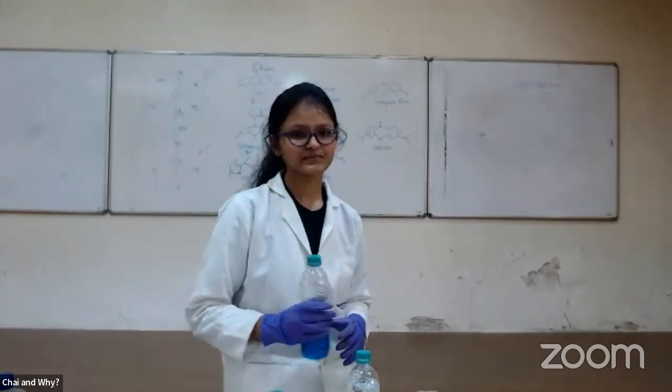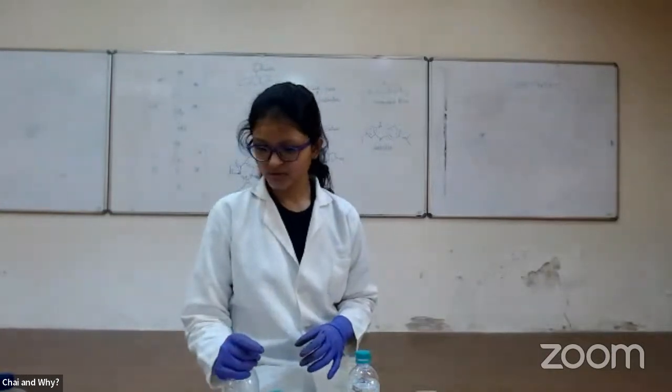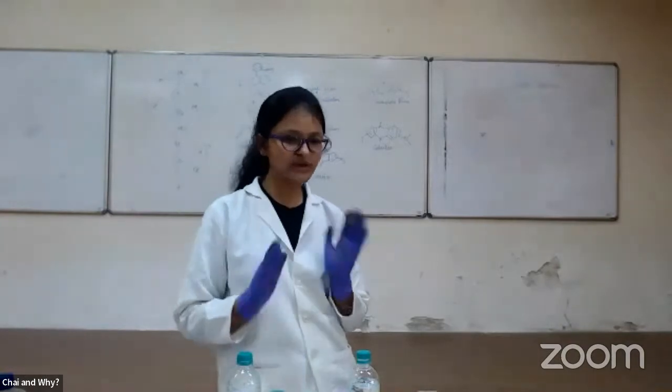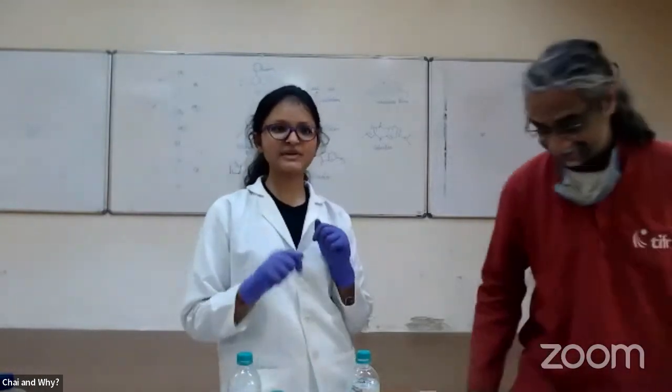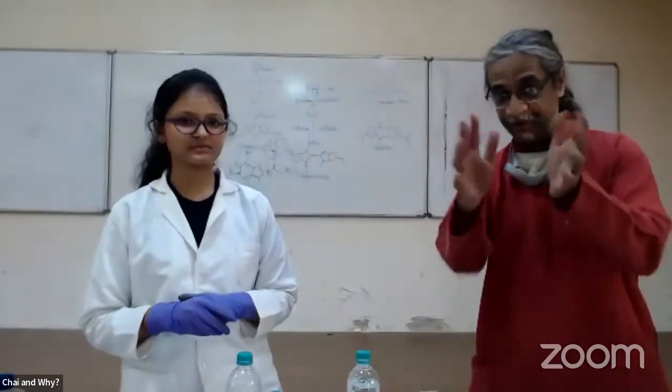Are there any questions on YouTube? Let's quickly check. No questions on YouTube. So with this, let us... Yeah, sorry about that reaction. We would eventually do it sometime with the exact precise amounts of chemicals. But otherwise, this is for the online audience.